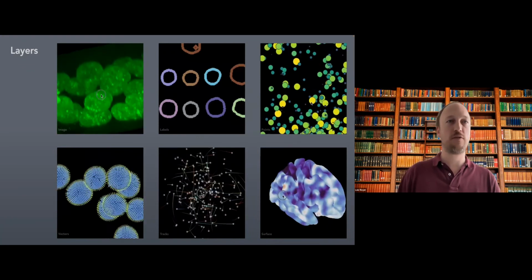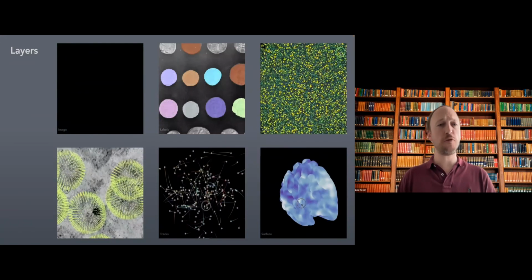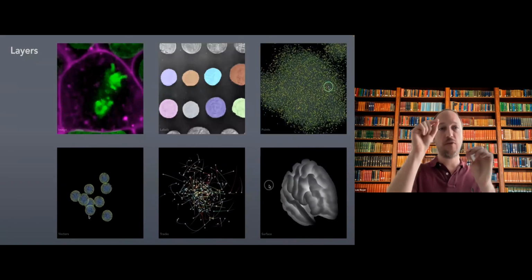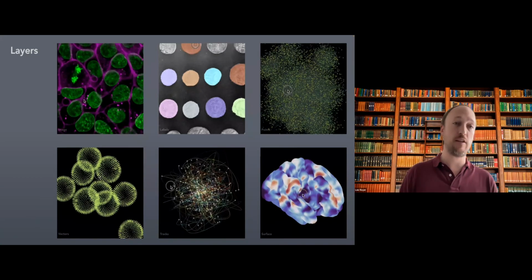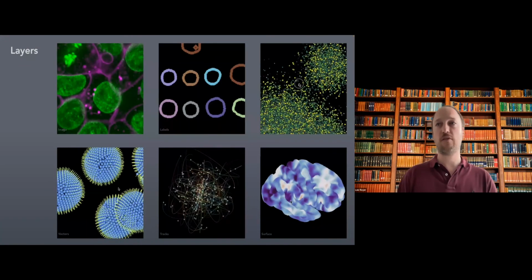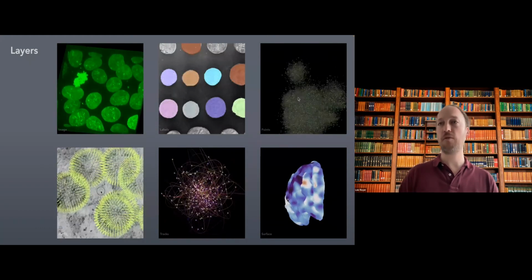You can also have vectors, like what you see here on the bottom left. We also have a track layer, which lets you show the trajectories of objects in 3D and in fact in ND. We also have a surface layer that is also potentially very exciting for people that do functional imaging of different kinds.